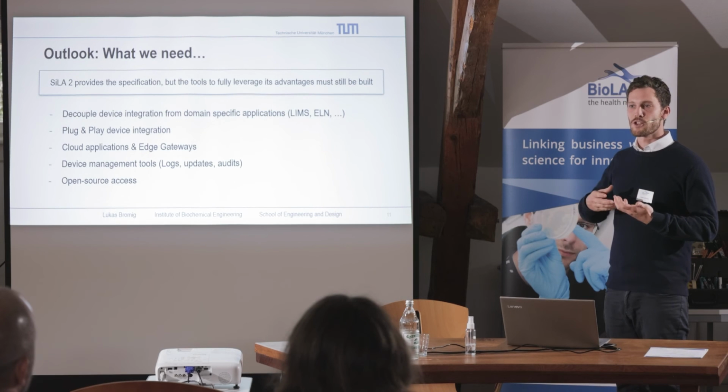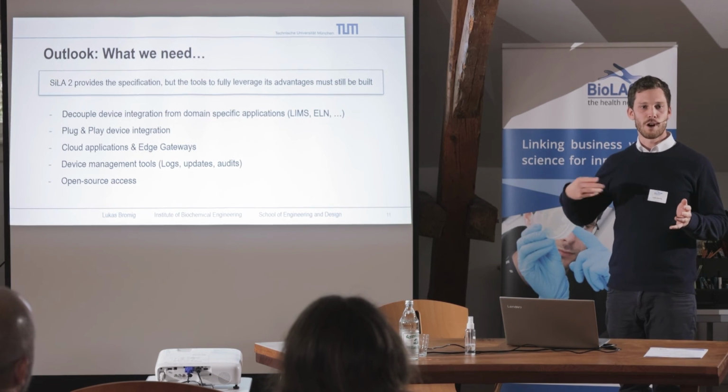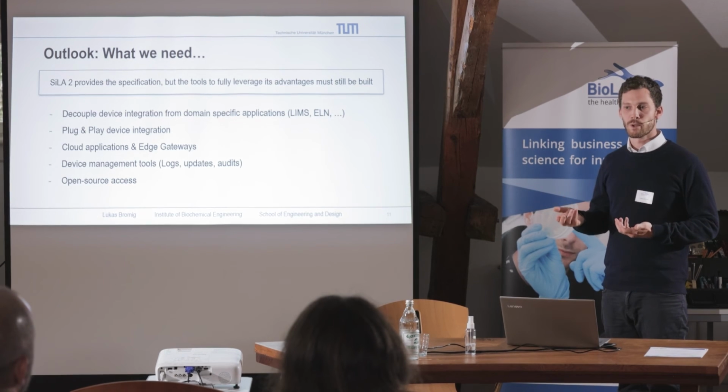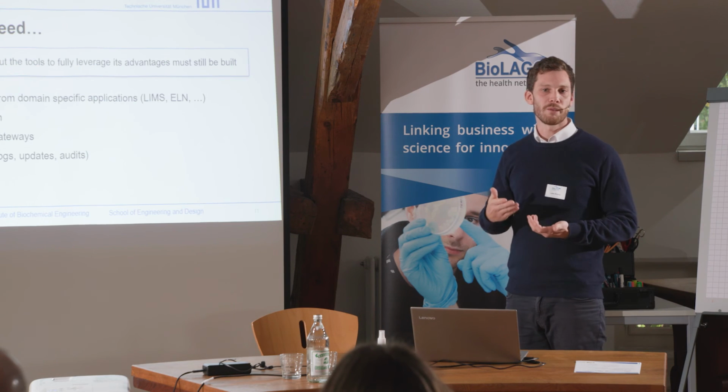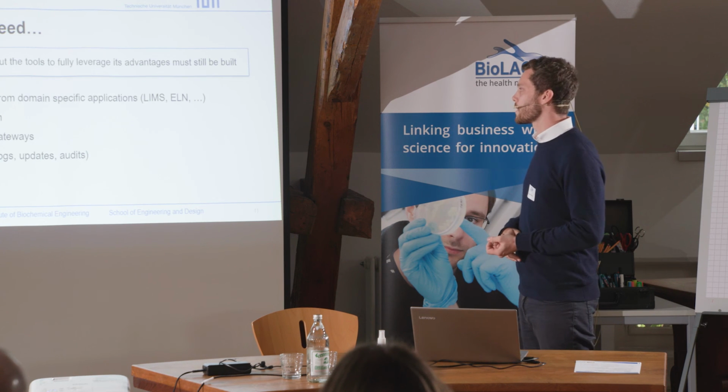A solution that shows you how many devices you have, what their current status is, what the logs of the servers are, and so on. Maybe even a tool that supplies you with insights on usage, how often these devices are used, how often certain functions are called. That would be quite handy to have.